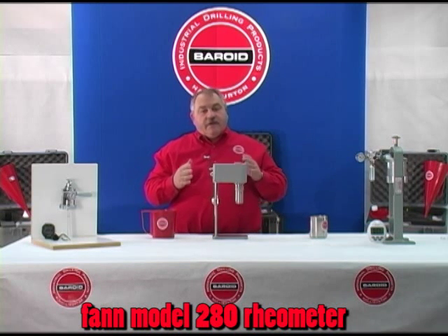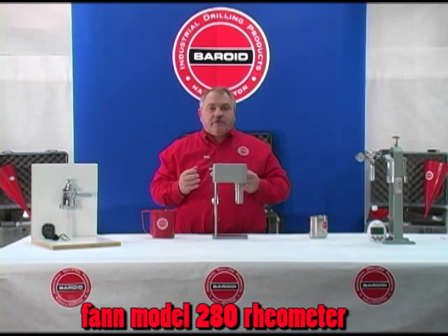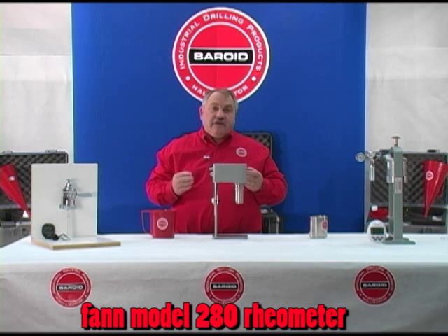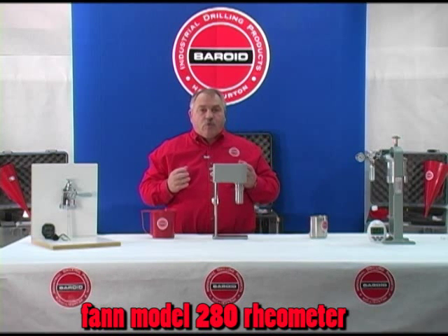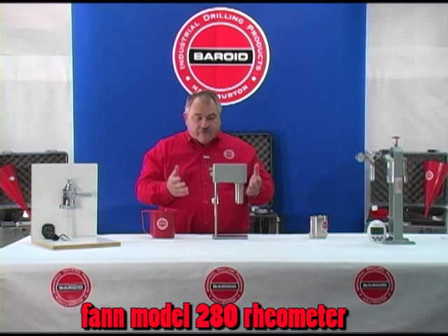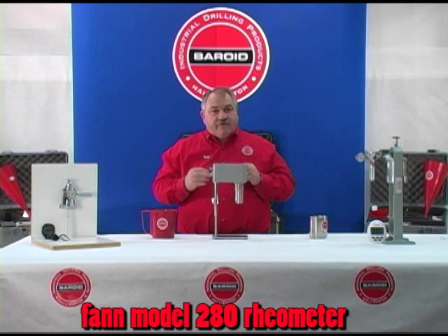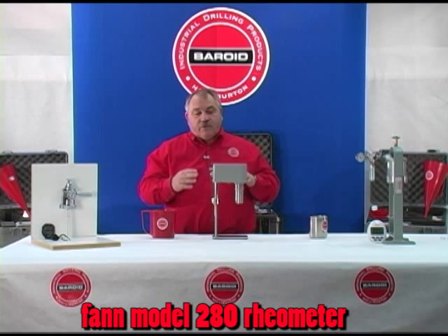When assembled, this piece of equipment allows us to measure properties of the drilling fluid called plastic viscosity and yield point. These two properties are more internal properties in the fluid — properties that you can't see with the naked eye and just simple tests. So we have to have this piece of equipment. It's a precision piece of equipment.